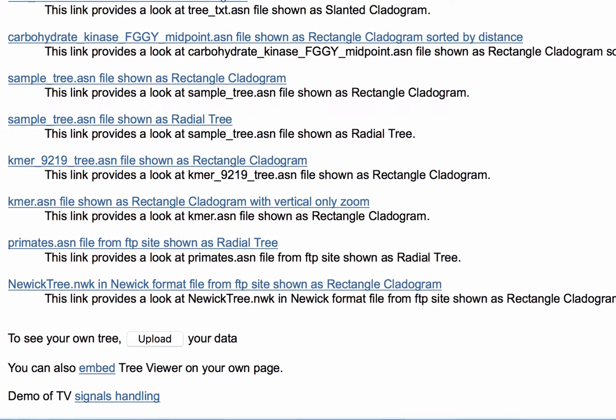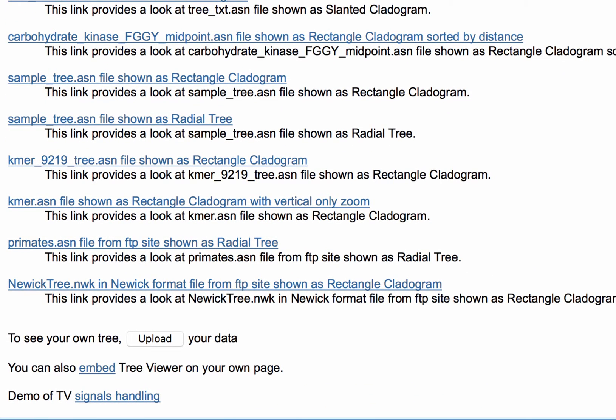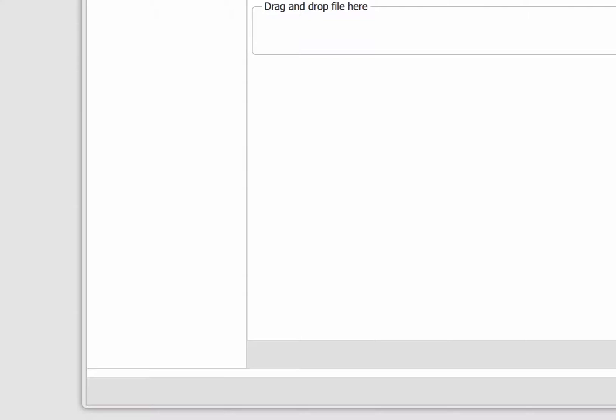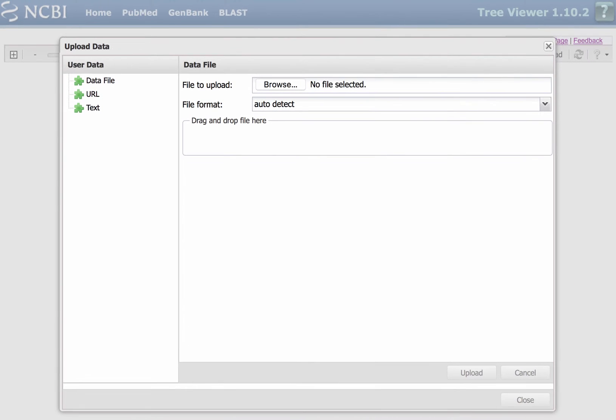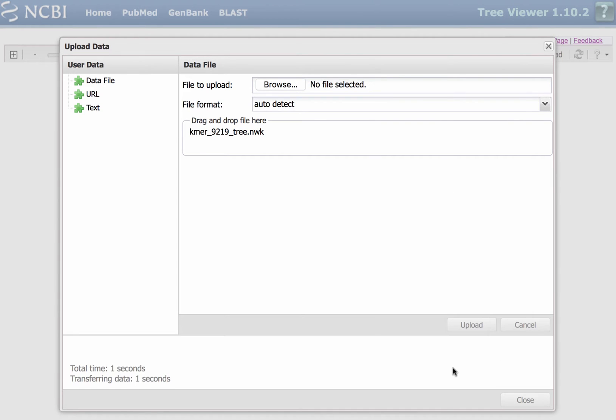As well as the Upload button that allows you to see your own tree. I'm going to upload a NUIC formatted file by dragging the file into this drop area, clicking Upload, and then Close.